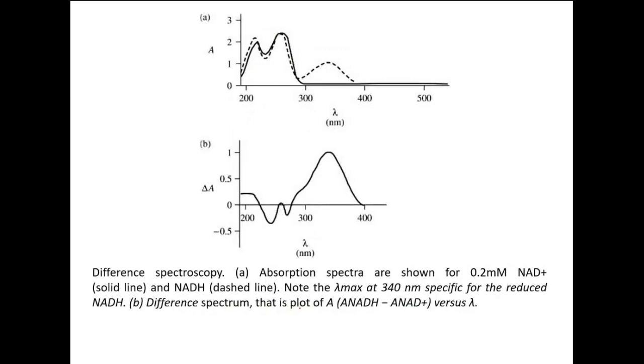Similarly, as I told you, you can even study the presence of the protonated or deprotonated form of any biomolecule. In this case, NADH: within the sample, you can easily differentiate the presence of NADH from that of NAD plus, the oxidized form of NADH. These can be studied by using UV visible absorption spectroscopy.